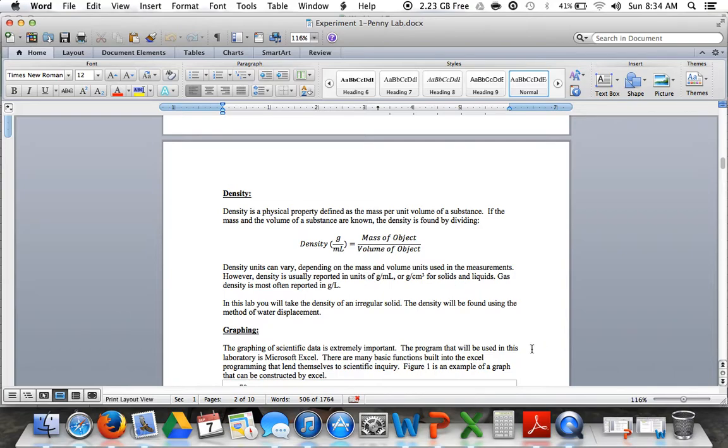So you'll be able to see that if I use a graduated cylinder, it only reports 2 sig figs if I fill it to 5.2 milliliters. But if I fill it to 10.3 milliliters and then raise the volume, you get the same deflection, but it's a bigger volume deflection overall, so you get more accuracy. It'll be really cool, I promise.